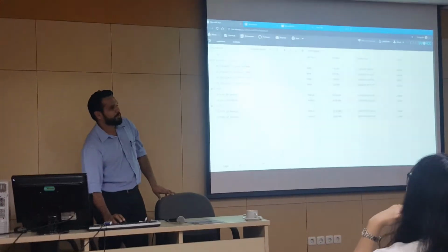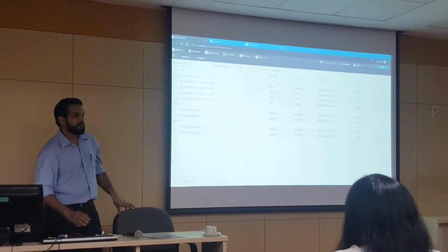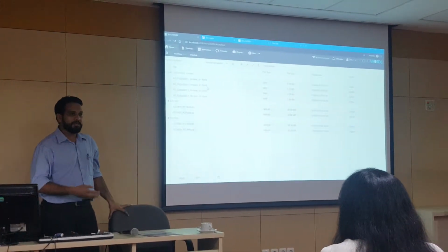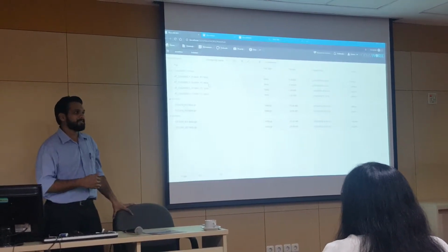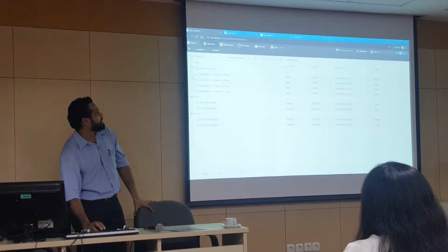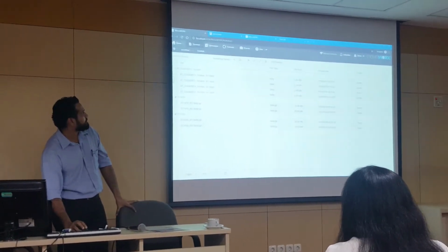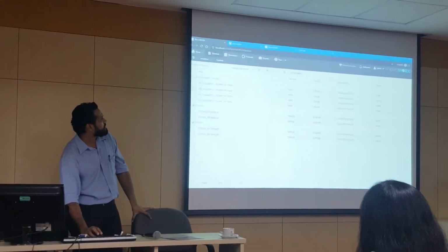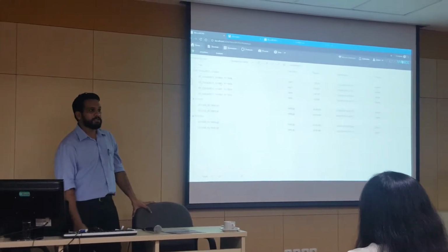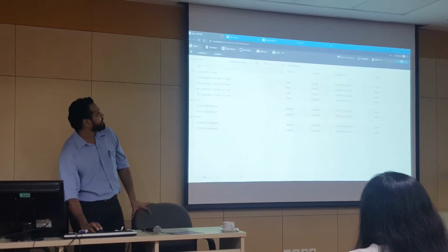So for example, I've uploaded multiple copies of the same file. They won't be deleted. Each copy of the file will be put in with a unique ID, and you will still be able to access these files. If you want, you can selectively delete the copies, or you can use all of these. You can selectively use either one of these when you're running your project. So once you're satisfied with your actual data upload, you can move on to building your references.